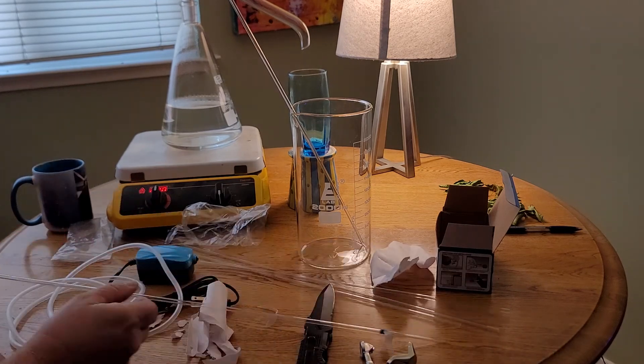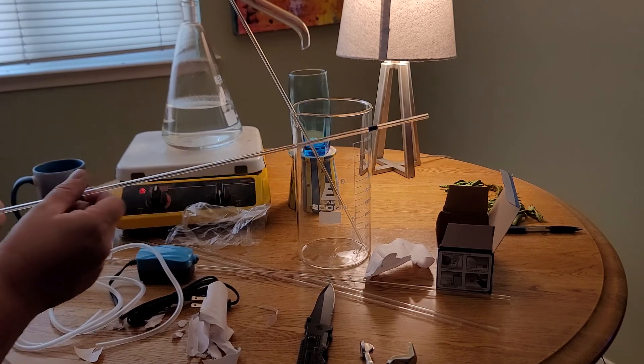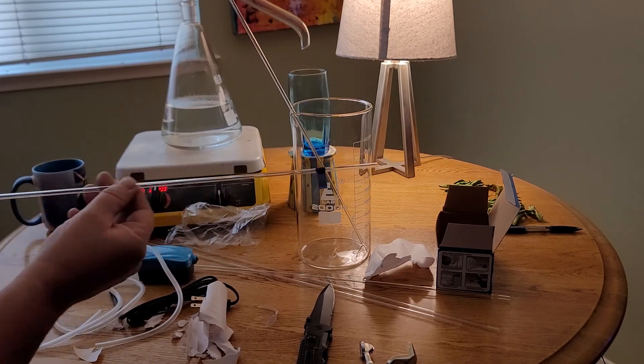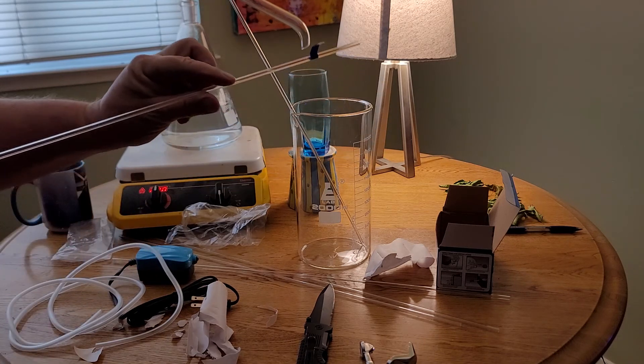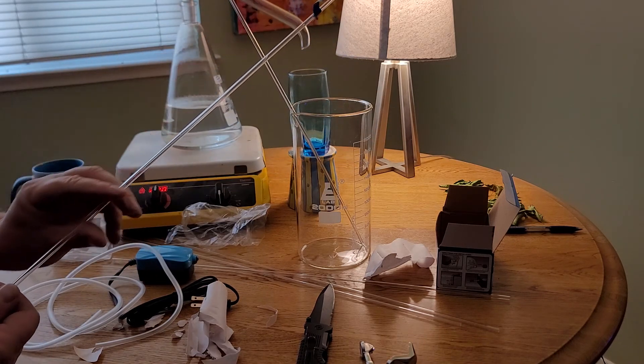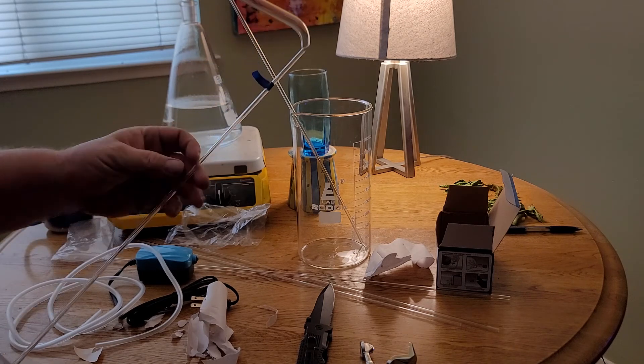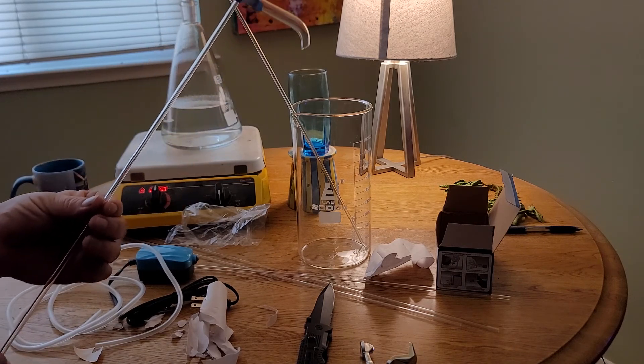In the Golden Book of Chemistry Experiments, it shows holding the tubing a little bit above a flame, not directly in the flame, but slightly above it, and then bending it. I'm going to try that at a later date and make a video with it and see how it goes.